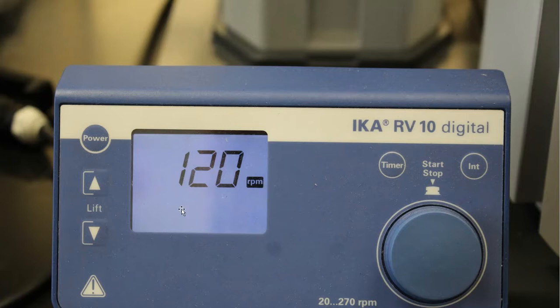So I can slow the spinning process down, or I can speed the spinning process up. Just like before, I use the knob to make the adjustment. I push it to turn it on. I push it to turn it off. Here are the minimal 20 and the maximal 270 settings for the RPM.